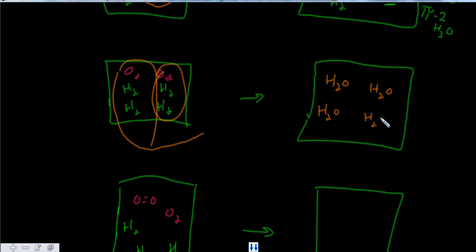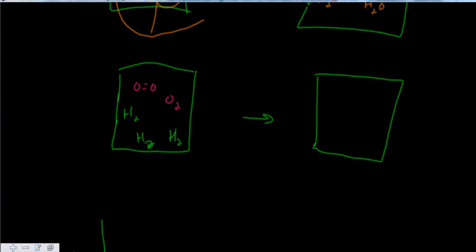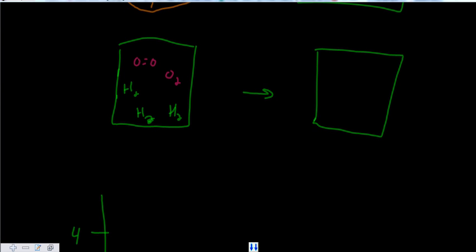Isn't that interesting? Oh my gosh, there is no hydrogen or oxygen left over. This is the optimal ratio to mix this hydrogen and oxygen together. In fact, we get the most products when we have the ratio which is described in the balanced chemical equation. Okay, so that's essentially what you're looking for in our lab tomorrow. Which ratio gives the most products?